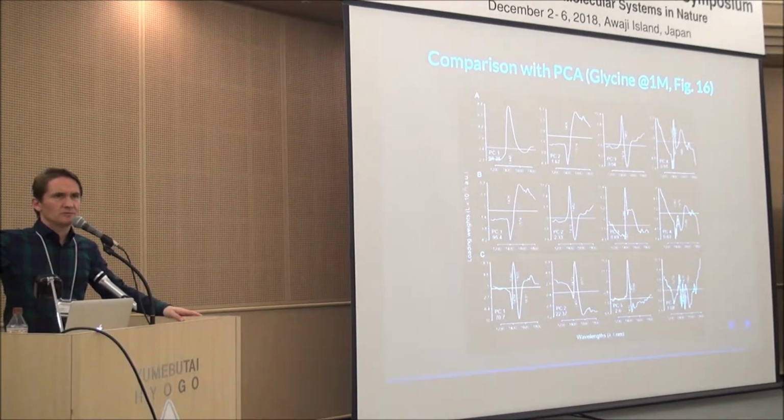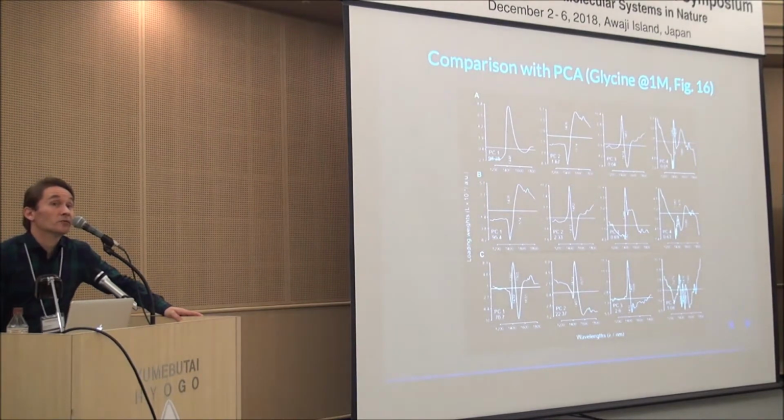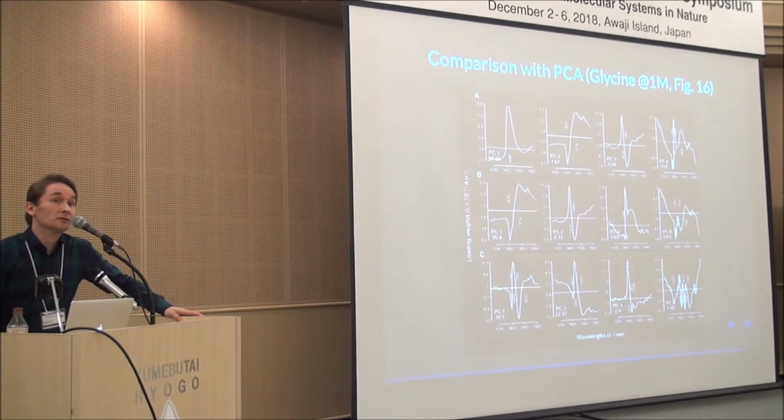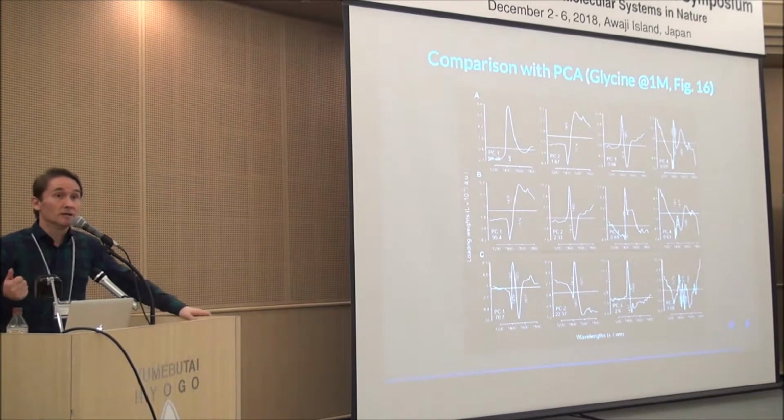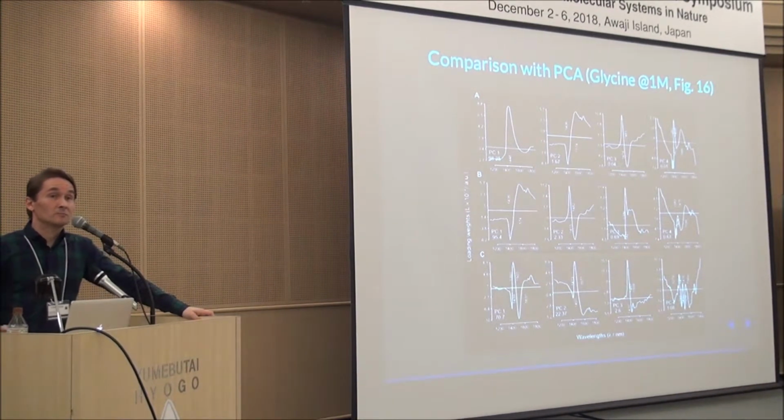You heat the spectra and you just let them cool. You just keep taking consecutive spectra, one after the other. By the time the sample is slowly cooling or heating, or equilibrating, it's generating enough spectra. So you need like 2 hours to get an excellent database that you don't have to fit or anything. But I'm still very tempted, and I'm intrigued by your idea, of somehow using fewer spectra and extrapolating and then building it into a model.